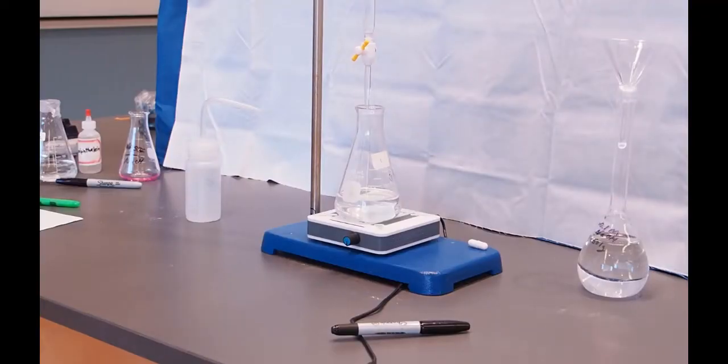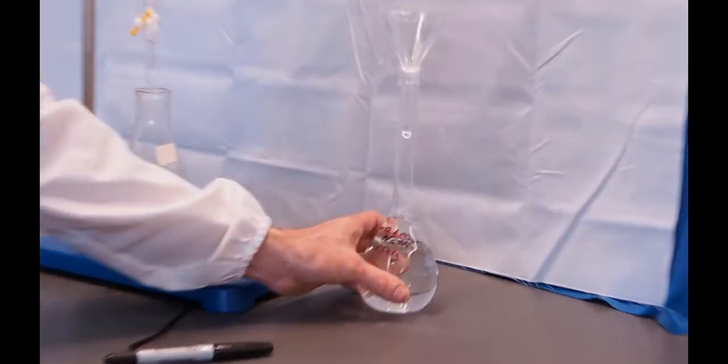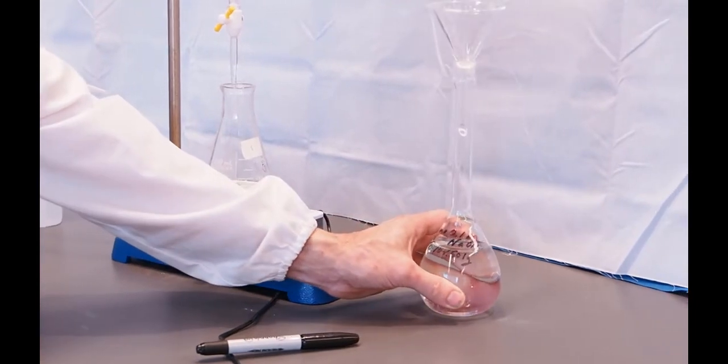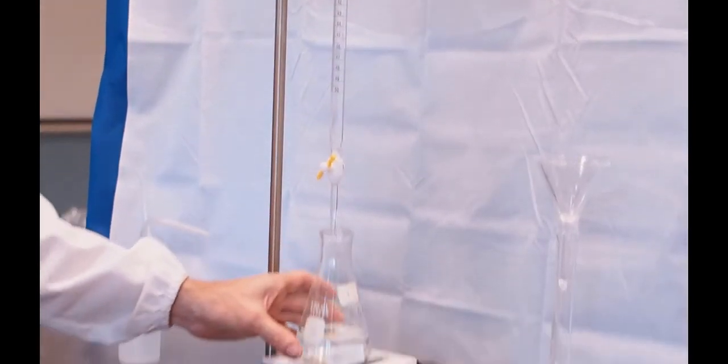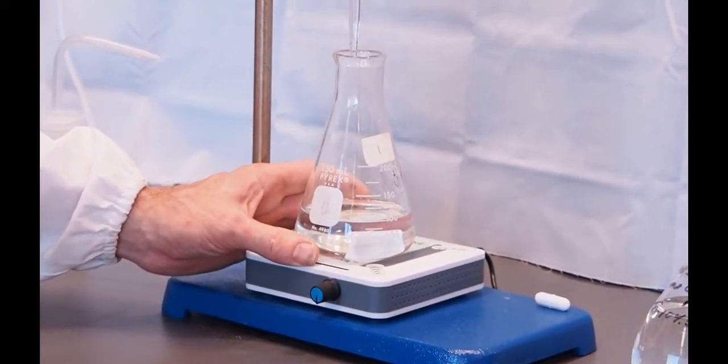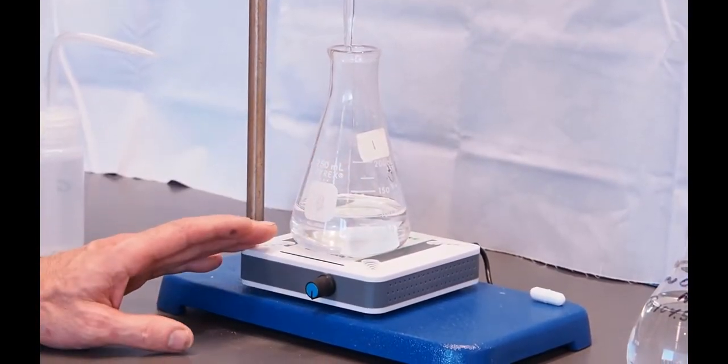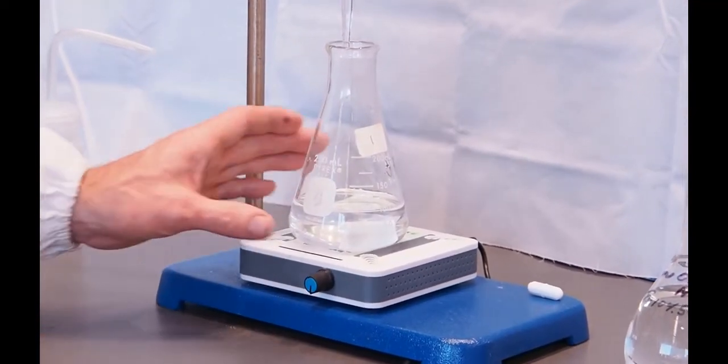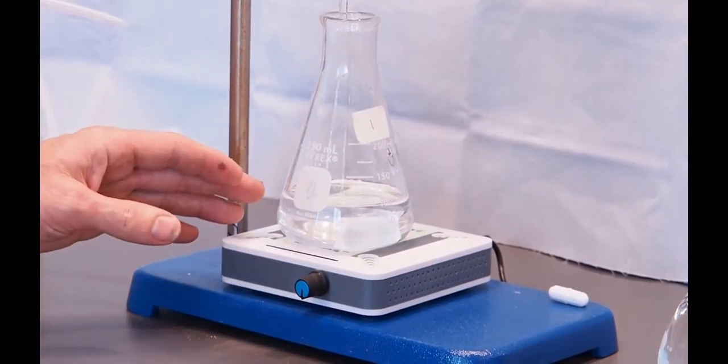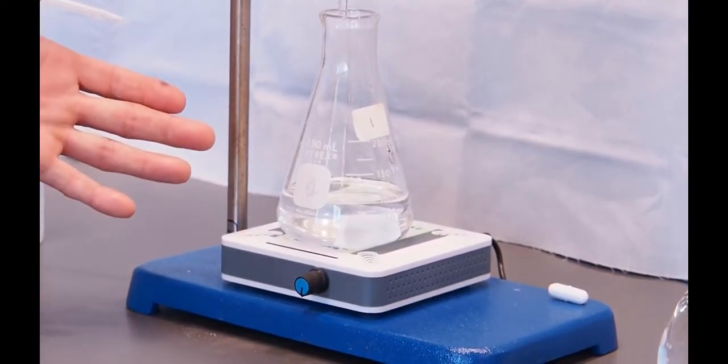All right, for this portion of the experiment, we have got our now standardized sodium hydroxide solution from part one of the experiment. That's loaded back up into the burette. And we have an unknown acid. This is HCl of unknown concentration. I've got 25 milliliters of this HCl solution and 75 mils of water. And two drops of our indicator phenolphthalein. Now we can begin our titration.